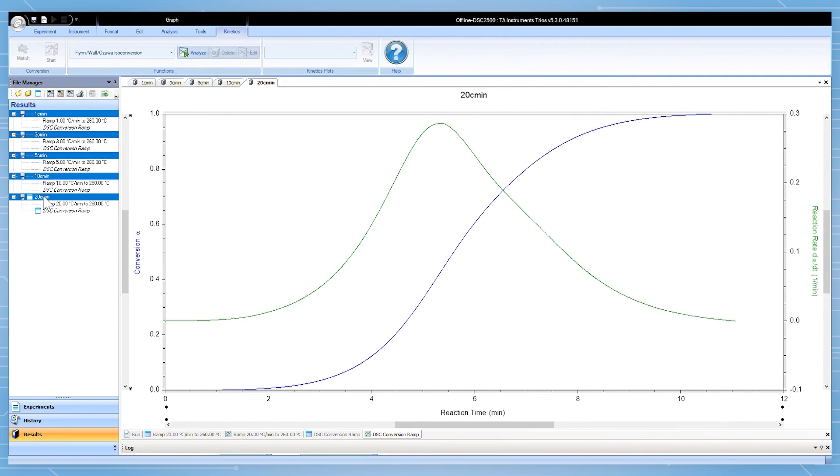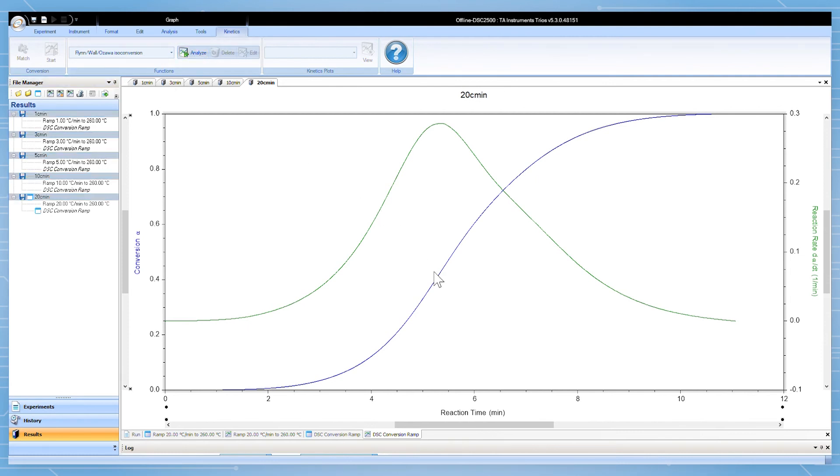Here I have the Flynn-Wall-Ozawa selected for the appropriate file type, so I'm able to click analyze. An Arrhenius plot will automatically be output along with various kinetics parameters.